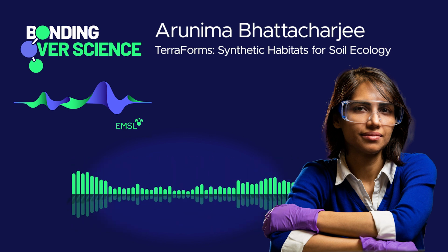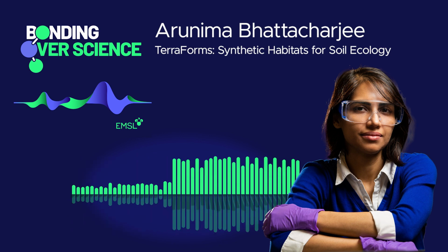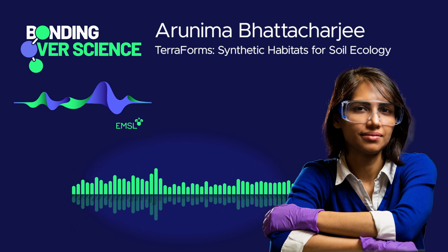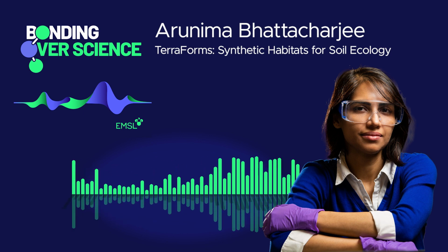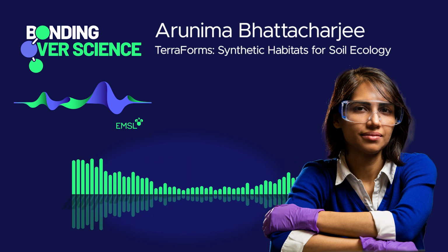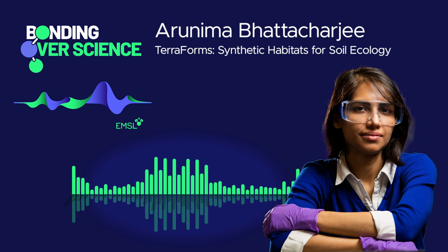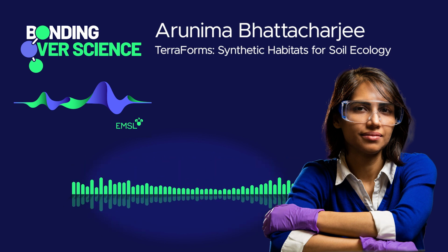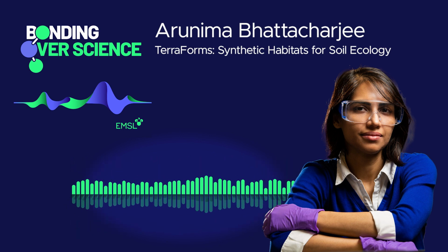And with that said, what kind of issues are we trying to solve in this research? Well, we typically accept user proposals that align with the EMSL mission. This particular capability fits within the rhizosphere sensor IRP very well, and also, to a certain extent, the biogeochemical transformation when we talk about a lot of soil minerals. The issue we are trying to solve is, suppose you have very nutrient-impoverished soils. Phosphorus is a very limiting nutrient right now, and so a lot of user proposals that we get look at how we can increase the availability of phosphorus for plant growth. That's one thing.